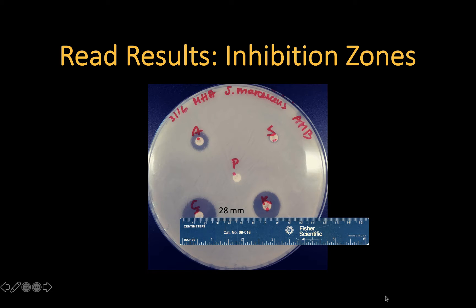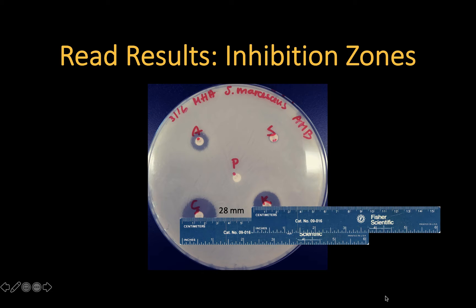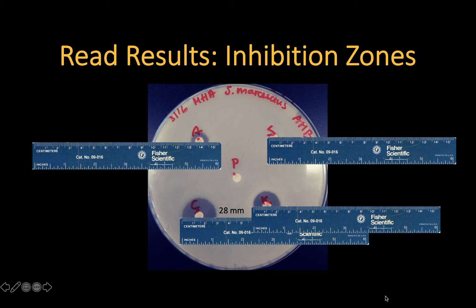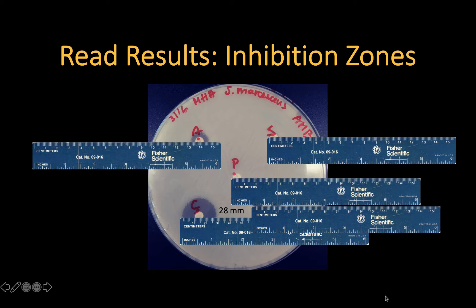Pause the video to determine the inhibition zones for kanamycin, ampicillin, streptomycin, and penicillin.